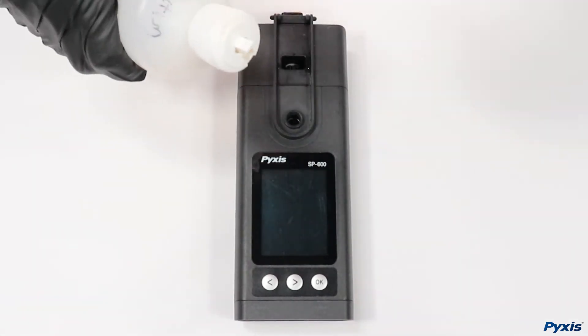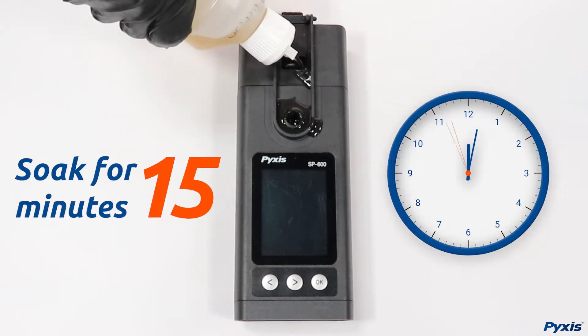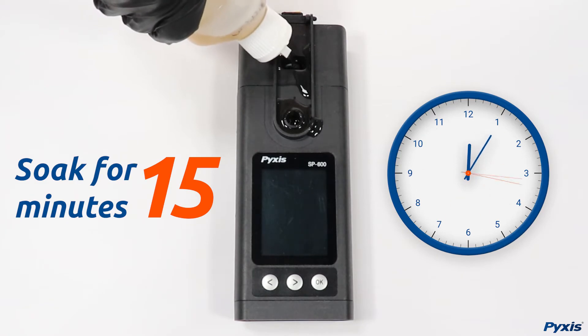Begin by opening the shield and pouring our handheld cleaning solution into the module and sample cell, then allow the solution to soak for 15 minutes.